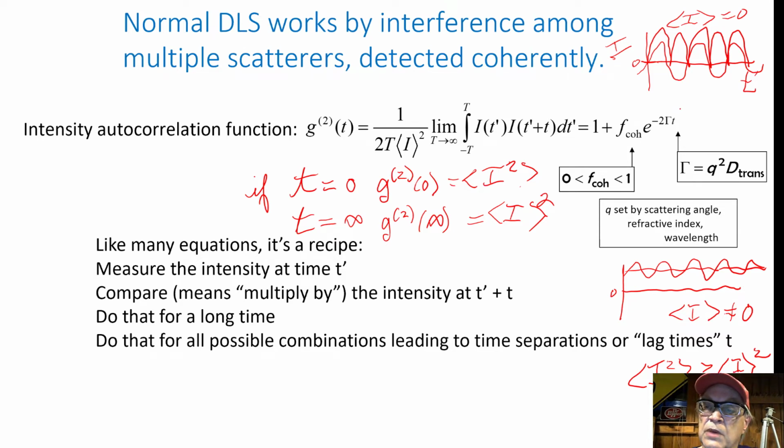So this correlation function, evidently as we go from lag time 0 to lag time infinity, undergoes some kind of decay, and it works out, and we're not going to prove this. That would be the function of 6751 polymer physical chemistry of solutions to do that. To prove that that is an exponential decay, but it is.